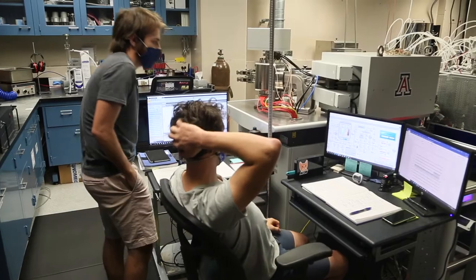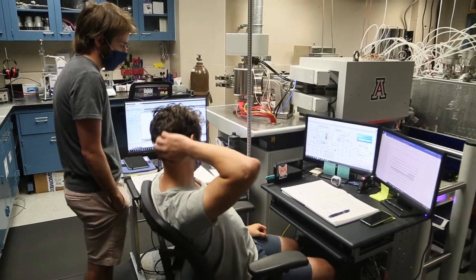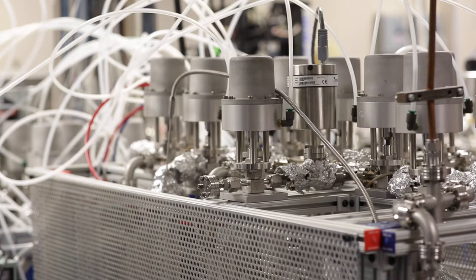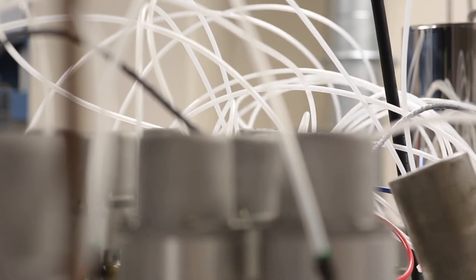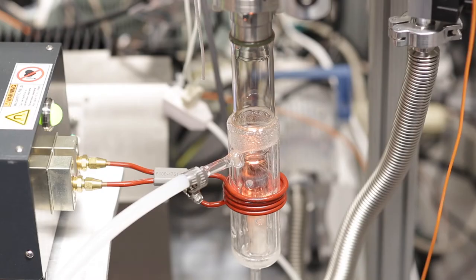In this lab we measure noble gases. We take our samples and have different ways of getting them into our mass specs. They'll go through prep lines so that we can clean the gas that comes out of the samples, then we'll isolate it and measure it after sending it through a magnet.